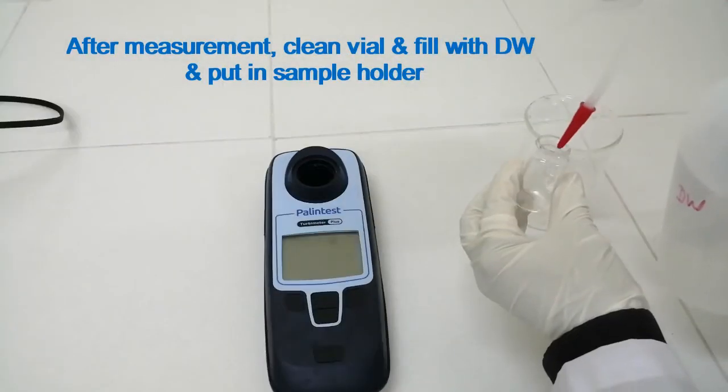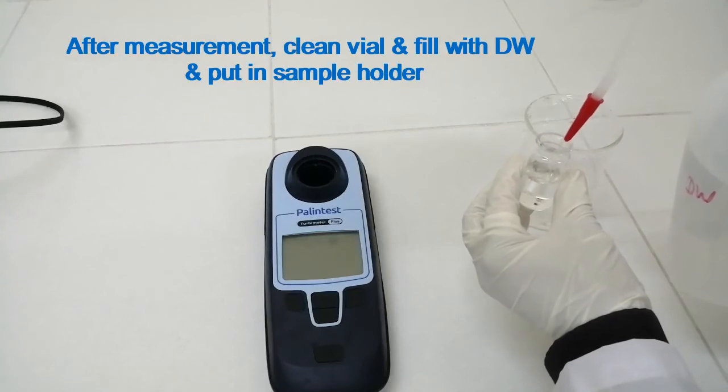After measurement, clean the vial and fill it with distilled water. Put it in the sample holder for storage.